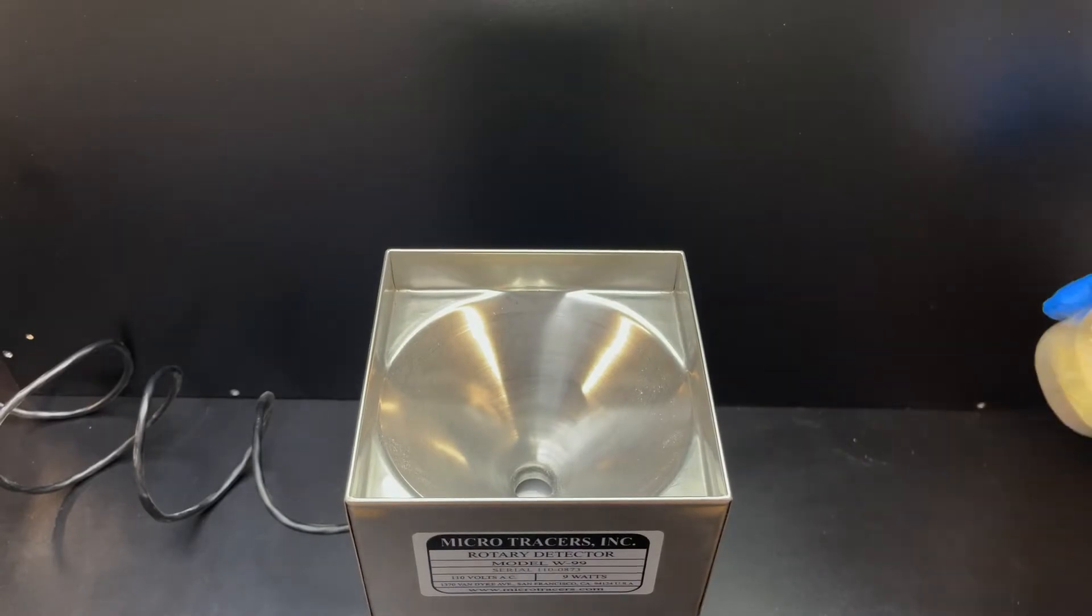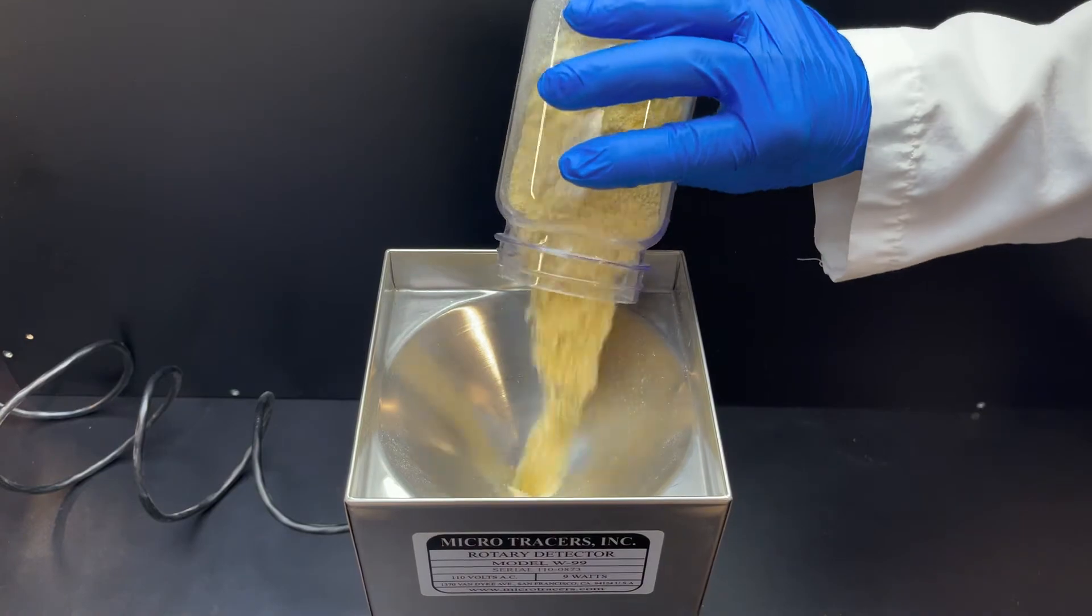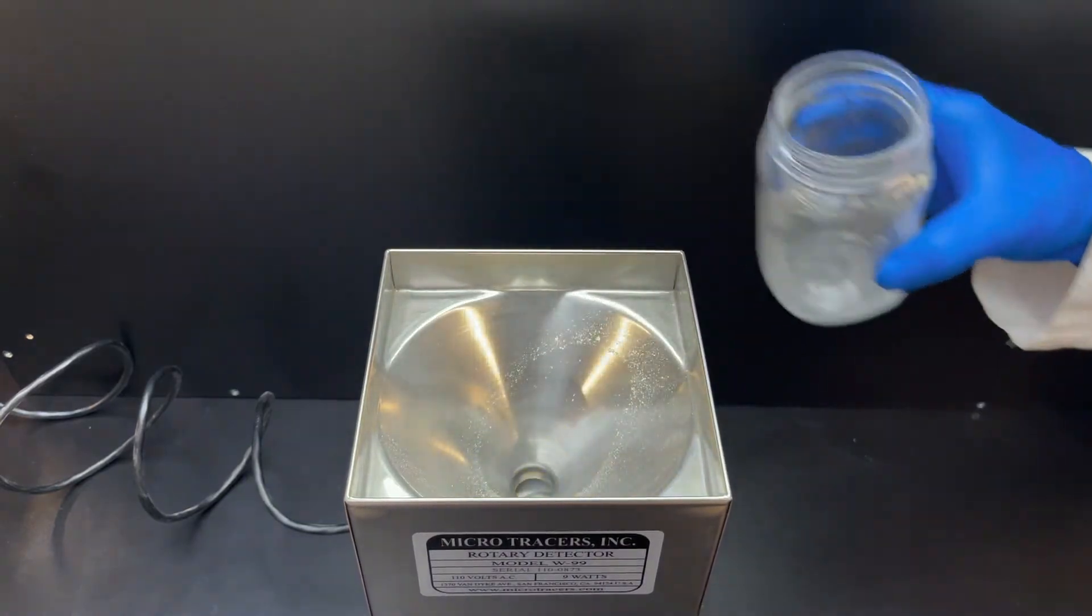Pour the feed sample slowly into the upper hopper of the rotary detector. If the feed becomes stuck, use the artist fan brush to unclog the feed.